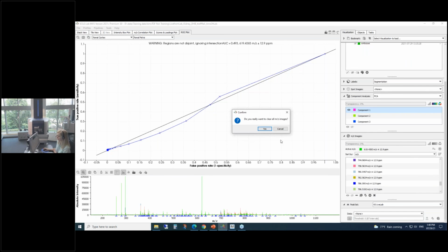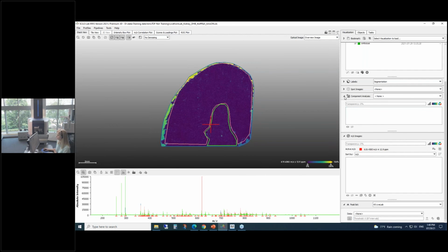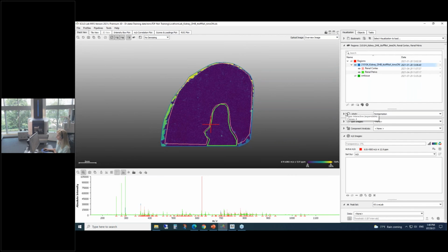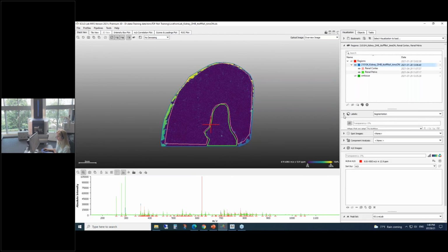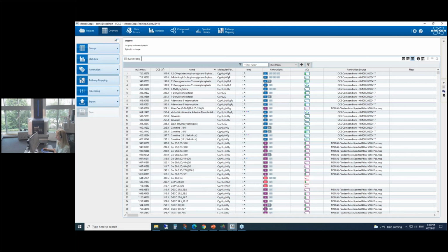All right, so now that I've shown you some of the statistical calculations, I'm going to turn off some of these functionalities, and I'm going to move to the last tool that I mentioned at the start of this, called Metaboscape. This is a metabolomic software that was originally written for LCMS that we've expanded to MALDI Imaging. Metaboscape is the tool that makes spatial omics possible.